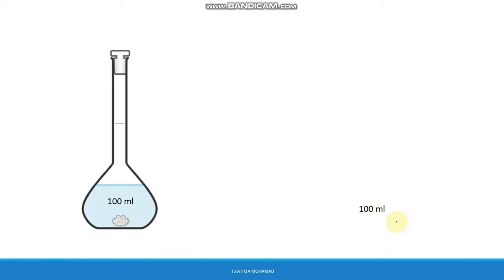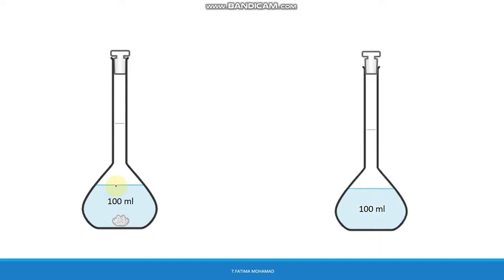We fill the volumetric flask to about half its volume and start shaking it to dissolve the solute completely. This means we shake until no visible solid remains — the solid will disappear after shaking and be completely dissolved.